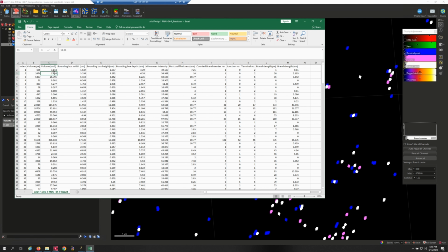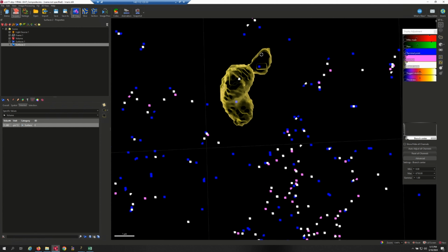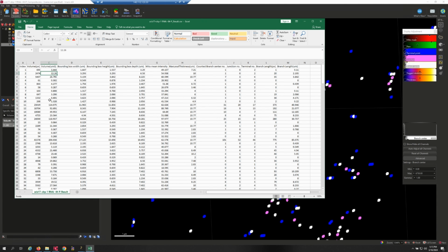Now, the calculation for this is, because in Imaris, it actually uses a bit of interpolation, and our surface has undergone some smoothing. So, there will be a slight difference in the calculations, but since all our data are converted using the same scaling factor, I think that in this regard, this slight difference is not a big issue.